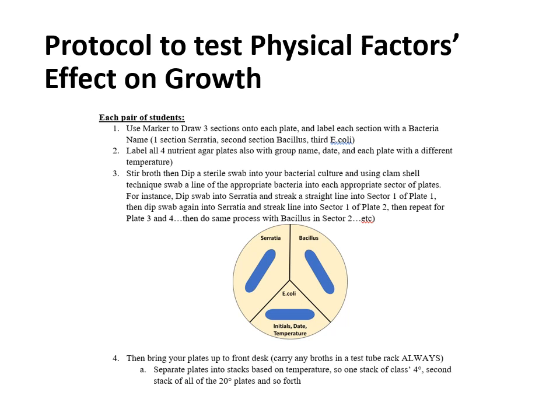They don't have anything bad in them. They're great for bacterial growth. Then what you do is you take each plate and you put it in a different incubator. So the 4-degree plate you would actually put directly into the fridge because the fridge would be 4 degrees Celsius. The 20-degree Celsius plate you would then put at room temperature to incubate. 37 degrees Celsius goes into an incubator set to body temperature. And 60 or 65 degrees Celsius plate, that would also be put in a separate incubator set to that high temperature.